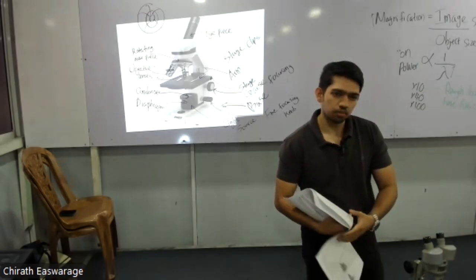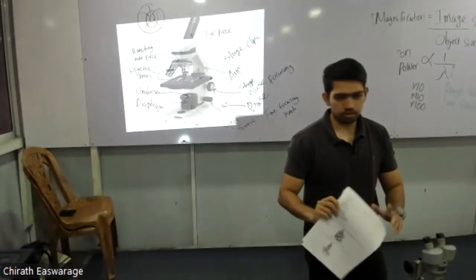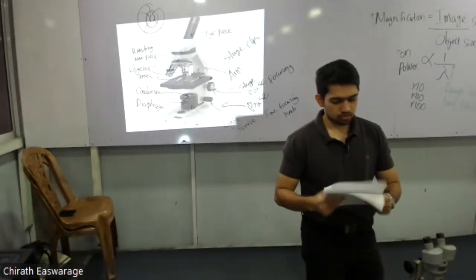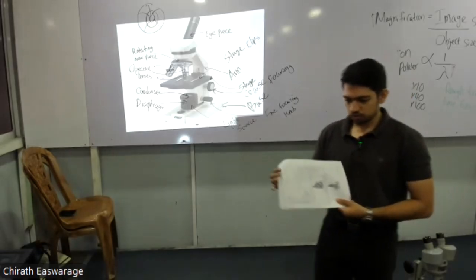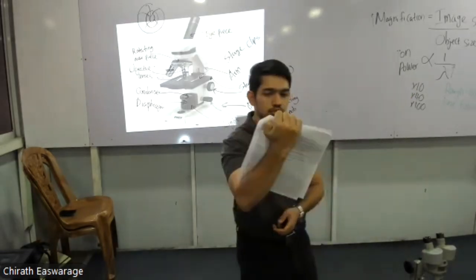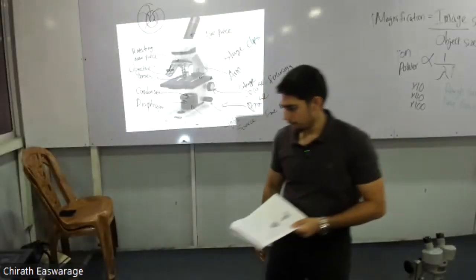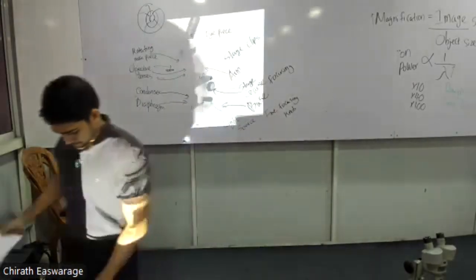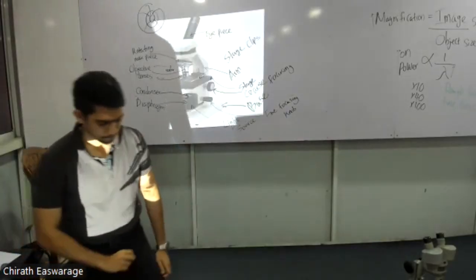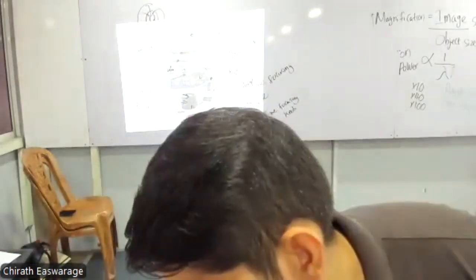First term test maybe will have a question to draw a microscope, not for the A-level. So better practice. Okay, page number 4 of the tute. Next page, there's a chart that we are going to fill now. You need to know what the functions are.